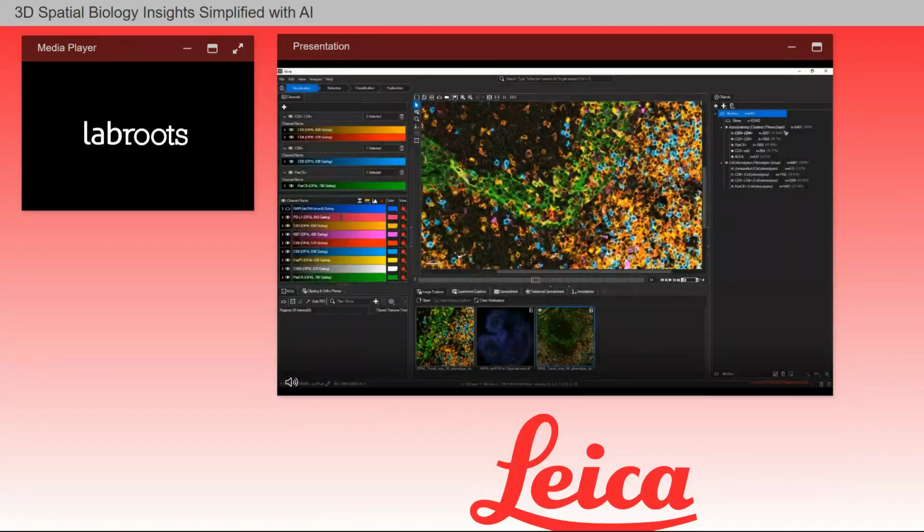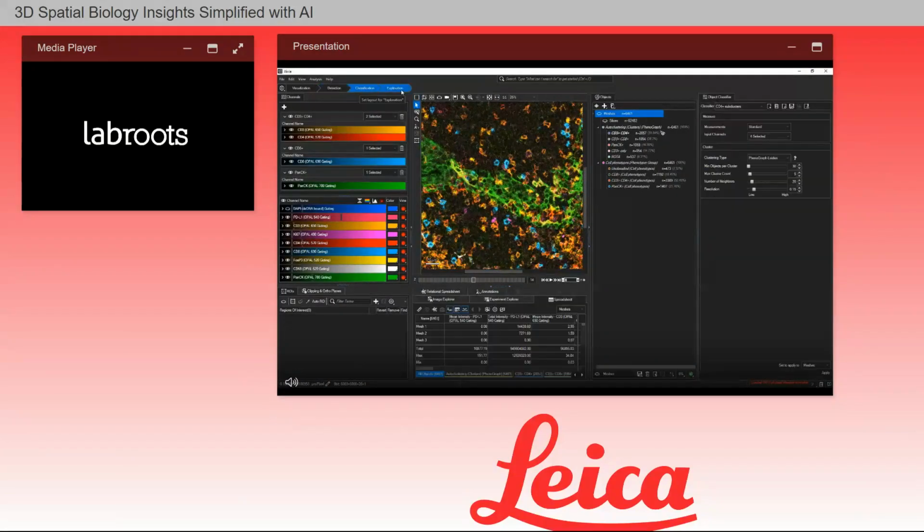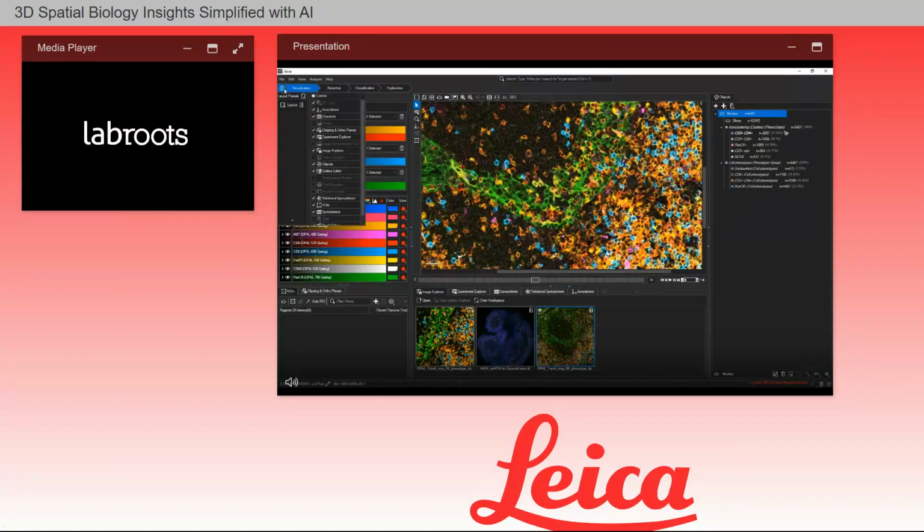In Aivia 14, we have designed a user interface to orient around 4 key tasks of image analysis. These tasks form the workflow chevrons you see in the top left corner of the Aivia window. There are 4 chevrons in the workflow: visualization, detection, classification, and exploration. In each tab, different tools and layouts are available to help you focus on the analysis task at hand. You can modify the GUI layout by clicking on the Options icon and selecting the tools from the menu. You can then save your layout for use in the future.